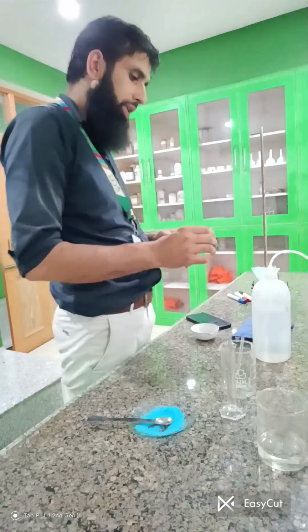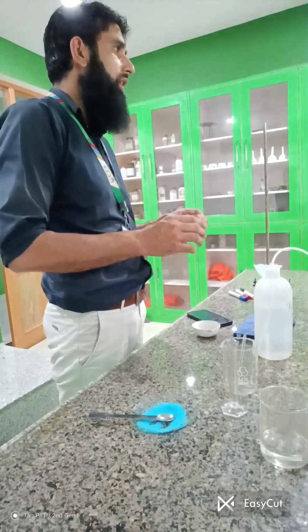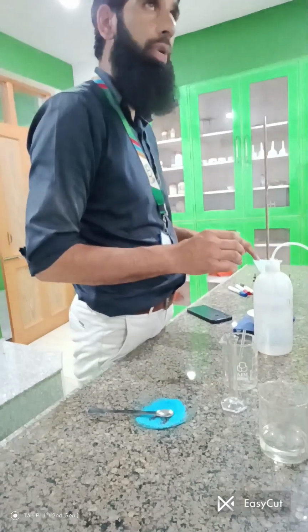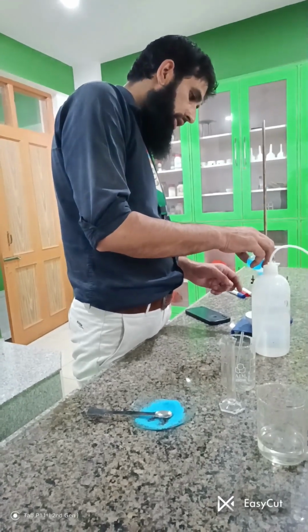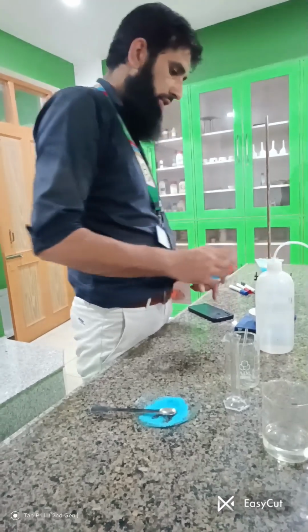Why do we have to filter it? Because maybe our solution contains some insoluble impurities. If there is some insoluble impurity and we filter it, it will remain on the filter paper. I have also kept a filter paper in it. The impurity will remain in it. The filtrate will come down in this china dish.